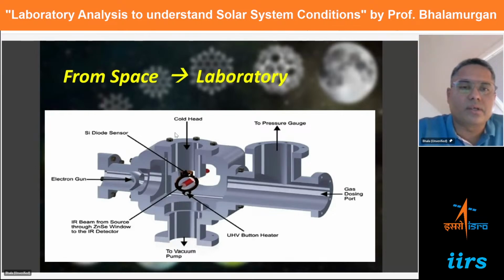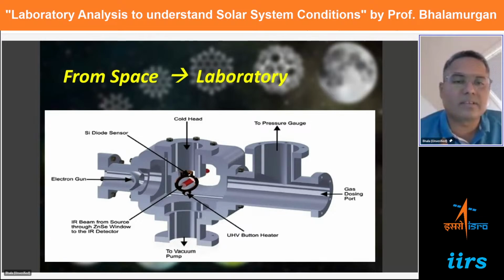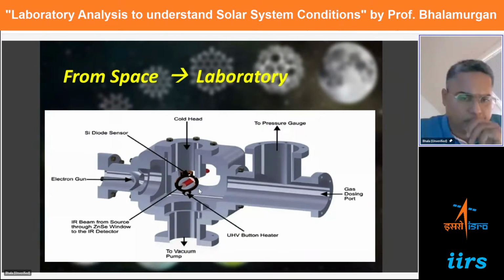And you see this outer chamber, what is there, this is made up of stainless steel. Okay, the outgassing from stainless steel is very less when you keep on evacuating the molecules inside. Otherwise, in the place of this, if you use some other material, for example, if you even use wood, it starts outgassing. So it is very hard to achieve good vacuum conditions. So that is why stainless steel is used. This copper here, this is the oxygen-free and high conductivity copper, so that you don't have enough oxygen there, which keeps outgassing. So these are all ultra high vacuum compatible components.